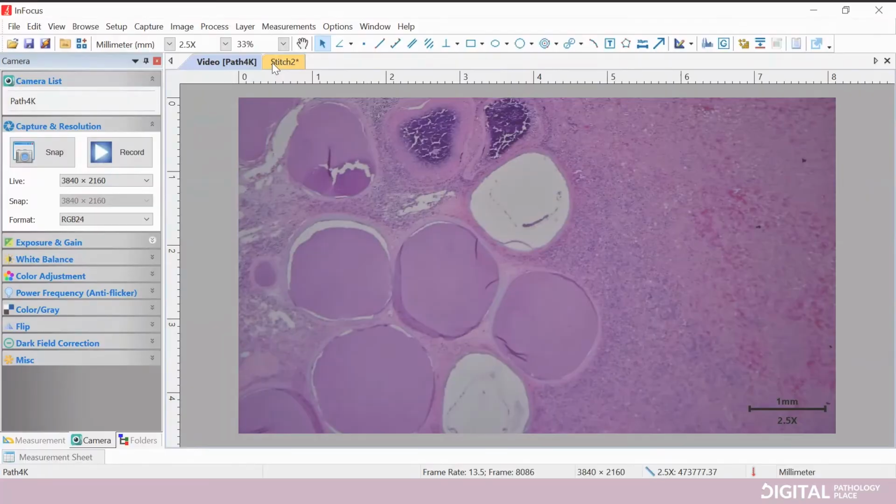Okay, and if I take my slide out, if I wanted to have like a mid-mag image of those 2 adrenals that I have, then I could do exactly that. We didn't capture it; it disappeared. But it's okay. I can do it anytime so here's the capture.